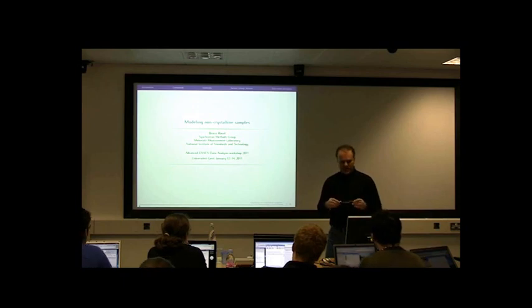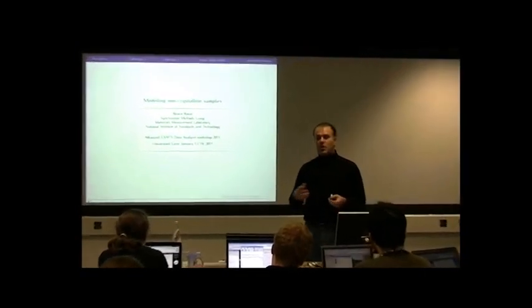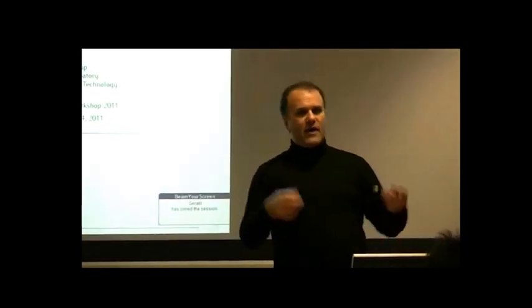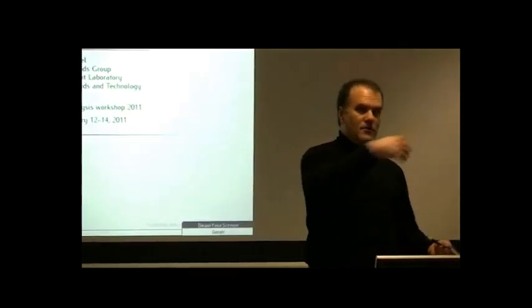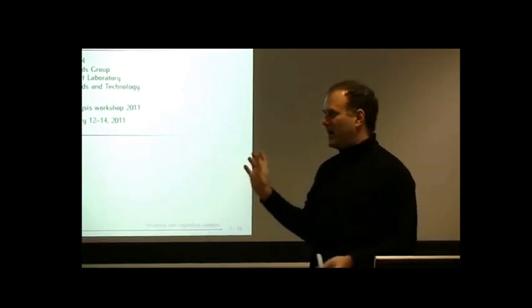So I'd like to give you a fairly straightforward example of a known problem with a known structure where you can get to the end and have a good fit without it being too complicated. But of course, nobody actually does research on something like iron sulfide.